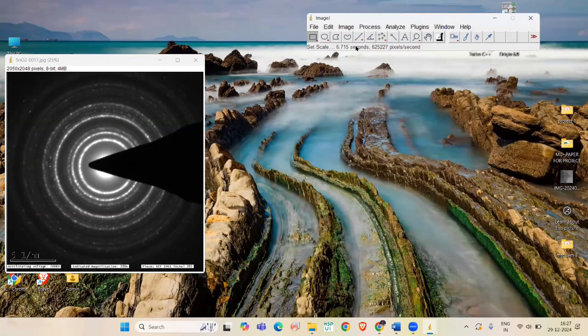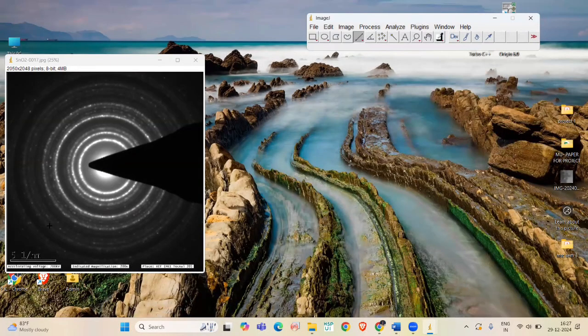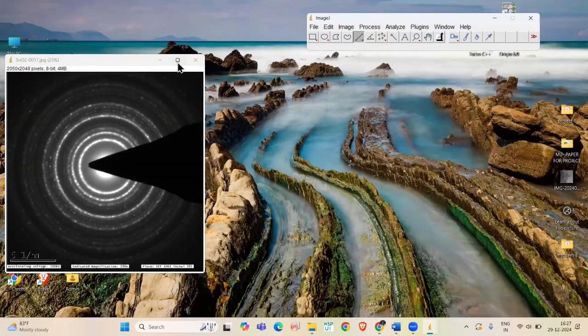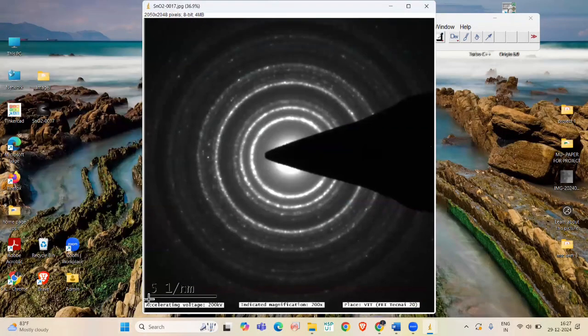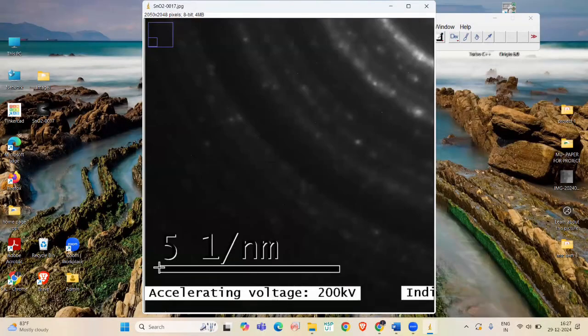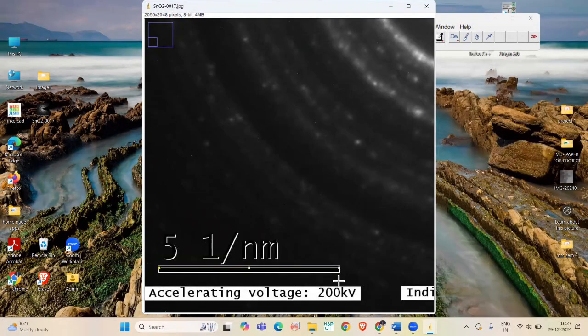Now, use the Line tool to draw your line over the calibration mark on your pattern. I am pressing Shift along with it to get a straight line.